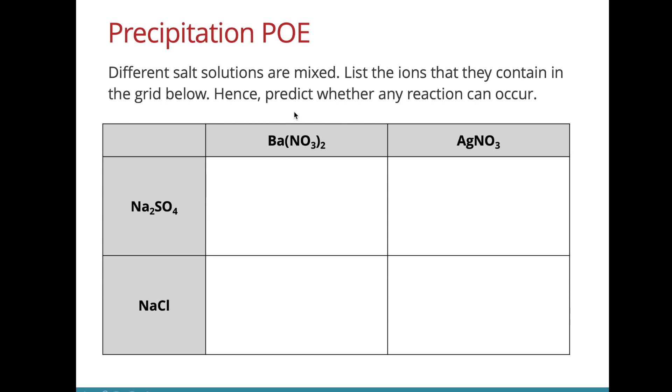I'm going to mix different combinations of solutions. Here, sodium sulfate, barium nitrate, sodium sulfate, silver nitrate, and so forth. In each pair that I mix, I would like you to predict whether a reaction will occur or not. Pause the video and think about this before I show you the results.